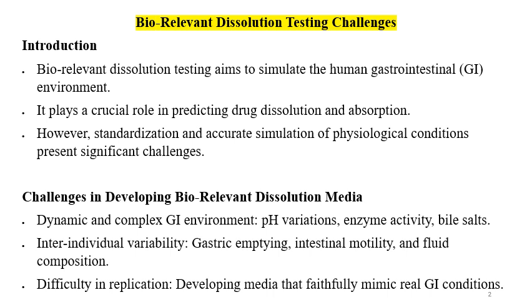That means by doing biorelevant dissolution, we aim to understand the behavior of the formulation or drug release inside the GI by doing in vitro testing. However, standardization and accurate simulation of physiological conditions present significant challenges. This video mainly covers the challenges in biorelevant dissolution.